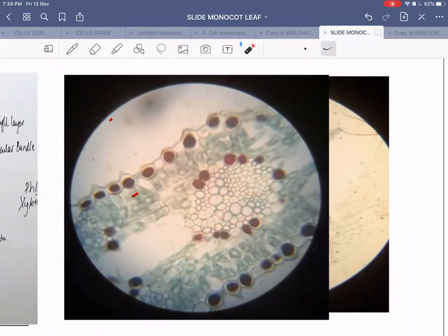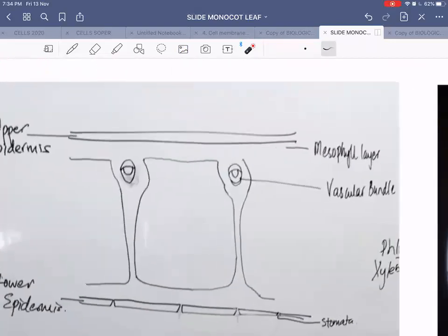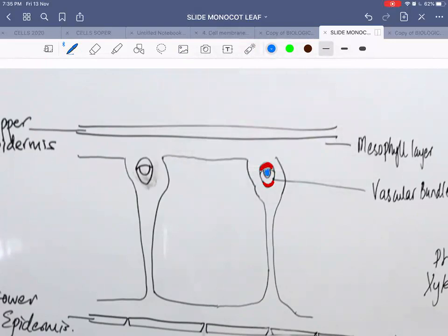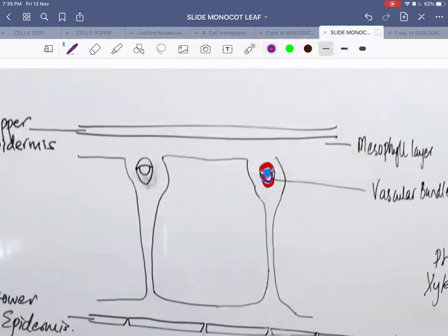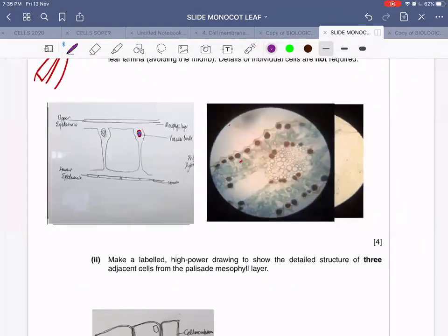If you can't see the sclerenchyma, that's okay — being able to see xylem and phloem is more than enough. This is your sclerenchyma on top, then the patch of phloem, and below the phloem the patch of xylem shown in purple. This is how you show the various layers of the vascular bundle on the low power plan diagram.